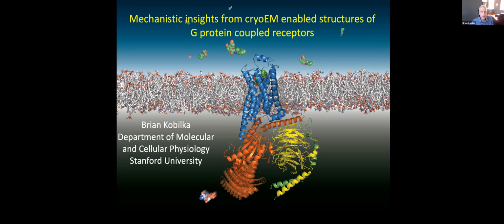welcome everybody. Good morning to those of you who are on the West Coast, and good day to the rest of you. I've been asked to give an overview of the impact that cryo-EM has had on our field, G-protein coupled receptors. First I'm going to give you a little overview of what receptors are for those of you who aren't in the field, and then a little tour through what we've learned about them through initially crystallography, and more recently cryo-electron microscopy, which has really become an extraordinary tool for studying GPCR structure and function.